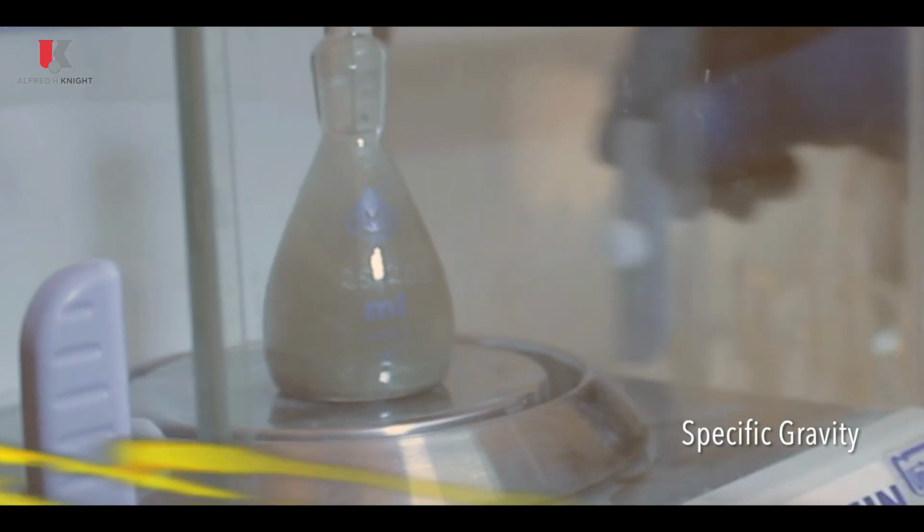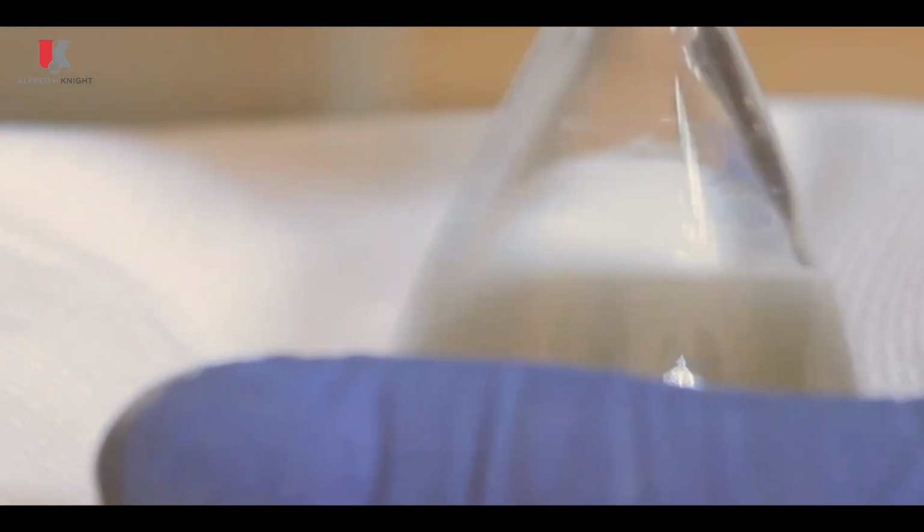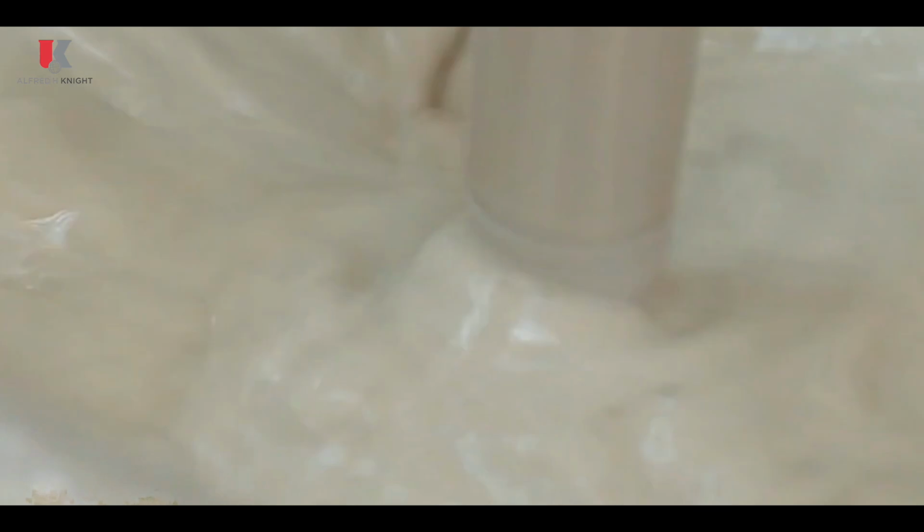Specific gravity. Here, the specific density is measured, which is a physical property inherent to each type of ore, concentrate, and tailings, and which significantly influences the sedimentation and flotation processes, among others.